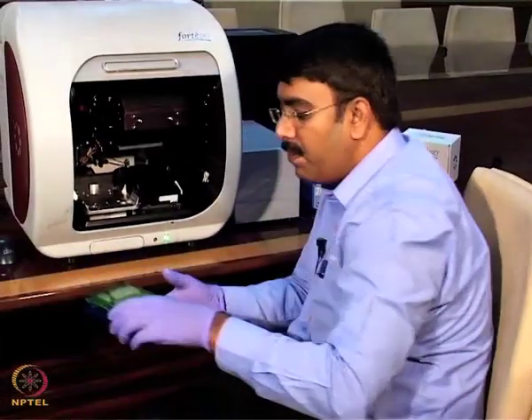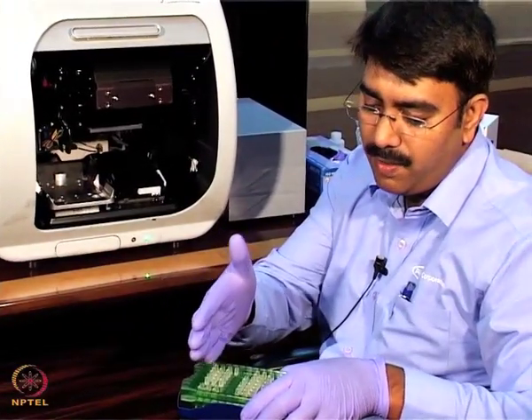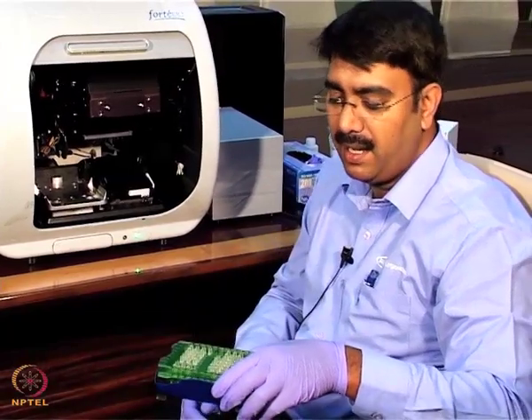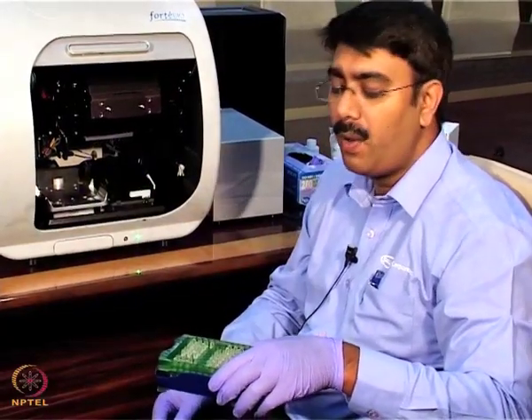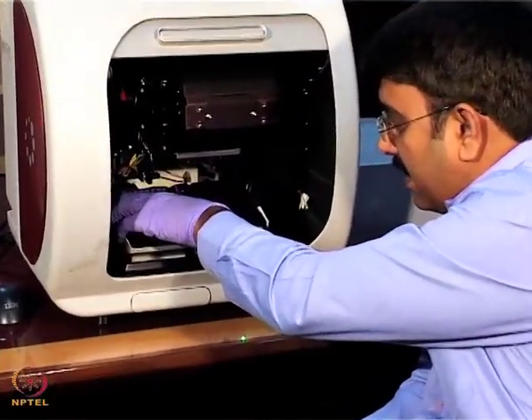So here I am going to place the sensor compartment. We can pick up the sensors from column 1, column 2 or column 3, anywhere; we can program it in the instrument accordingly. We are placing the sensor rack like this.